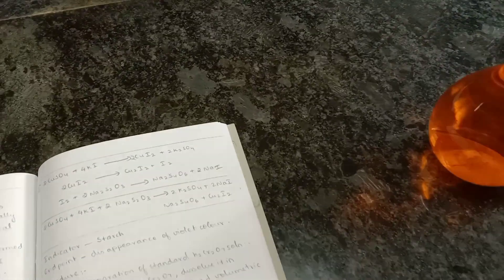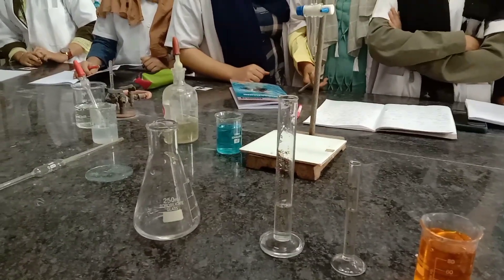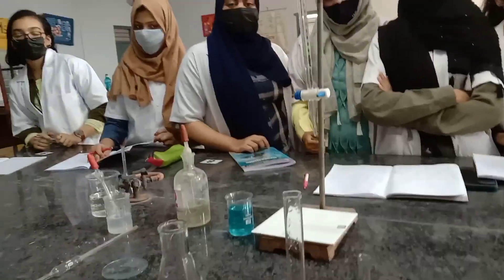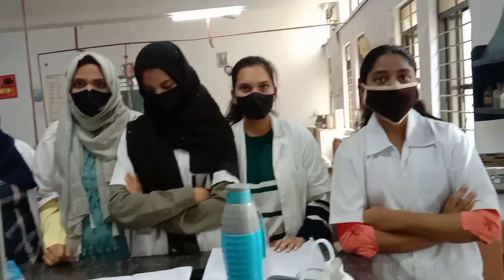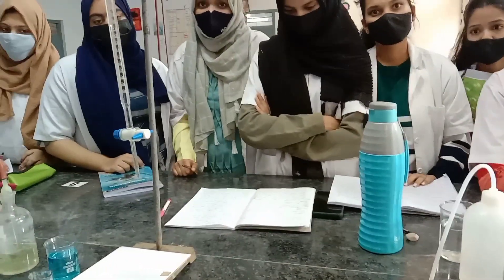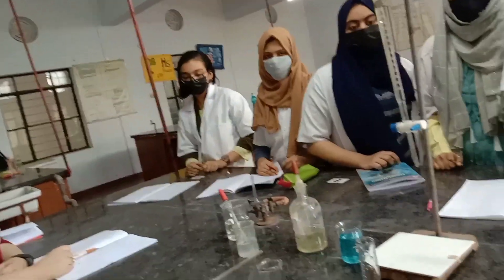Let's move on to Step 2. What is Step 2? Standardization of hypo. We standardize hypo using the standard potassium dichromate solution that we prepared in Step 1. How do we do the second step? What is the process of standardization of hypo?